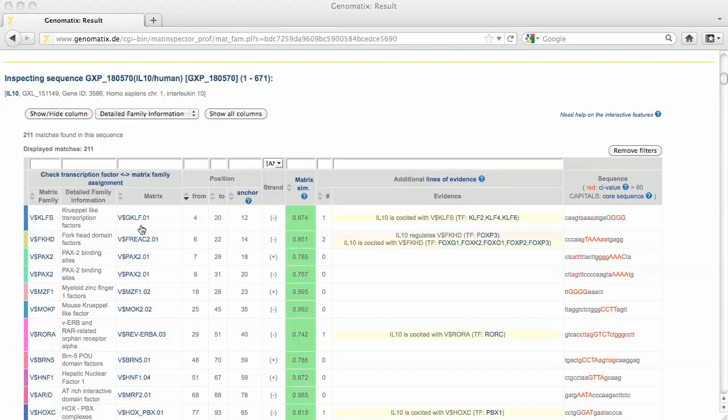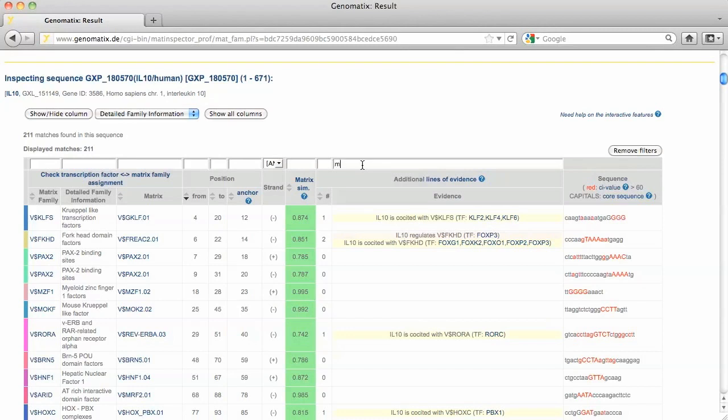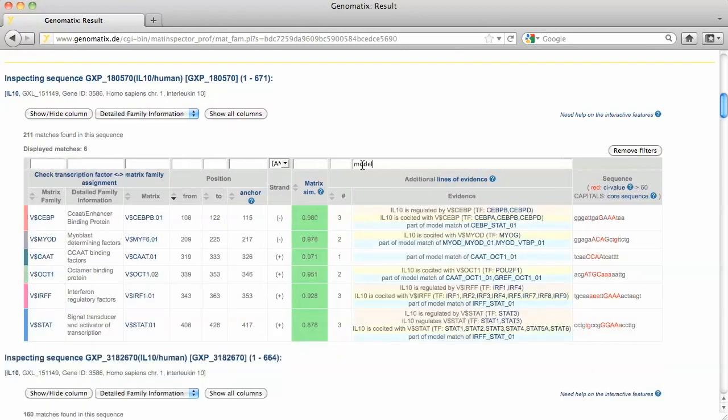Additional lines of evidence for functionality of a binding site are shown in this column. You can filter the list by typing text in filter fields and pressing return. To filter for matches with additional lines of evidence originating from a model match, enter 'model' in the corresponding filter field and press return.